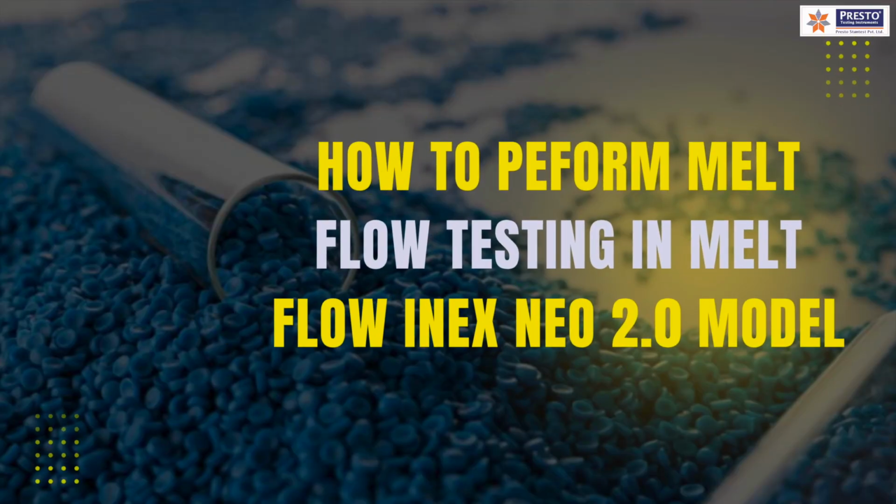हेलो एवरीवन, इस वीडियो में हम डिस्कस करेंगे अबाउट द मेल्ट फ्लो इंडेक्स नियो 2.0 मॉडल.